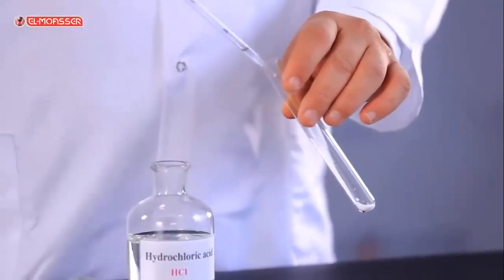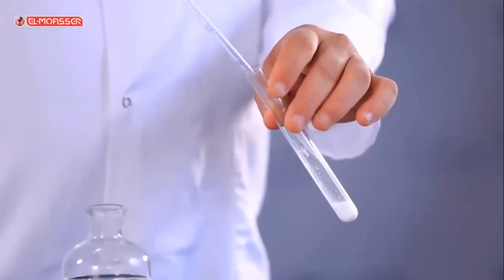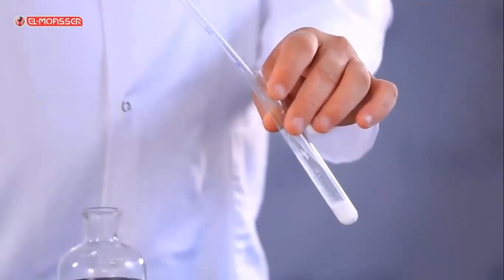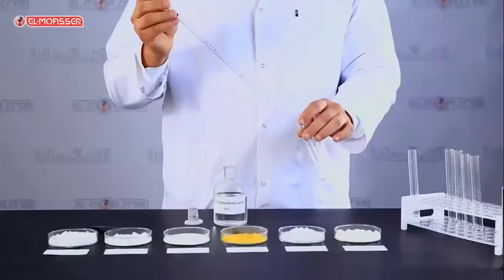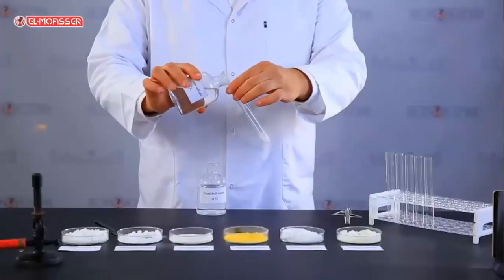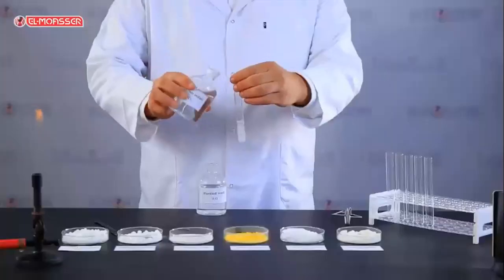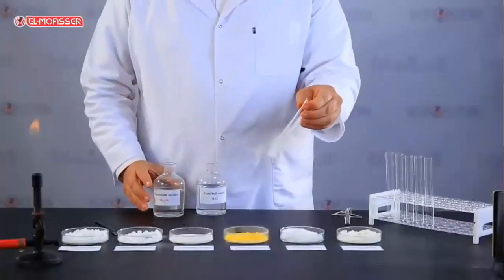Summary. On adding diluted hydrochloric acid to the sodium bicarbonate salt, effervescence takes place due to evolution of carbon dioxide gas. On adding magnesium sulfate solution to sodium bicarbonate solution, a white precipitate is formed after heating.